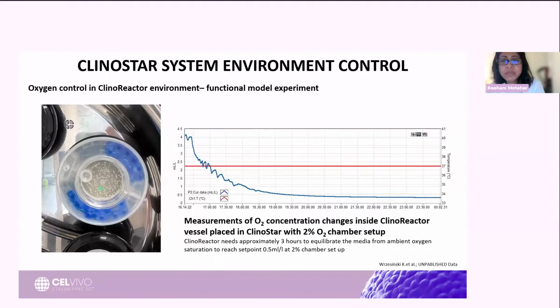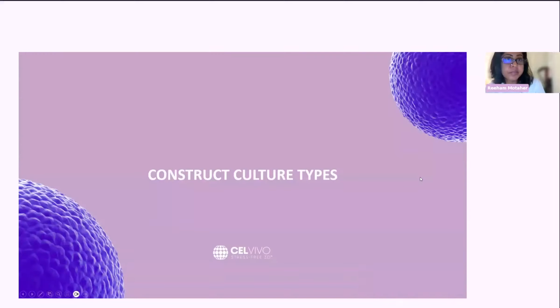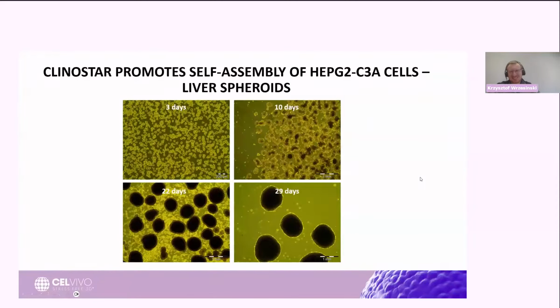Great, thank you. The second question that has come in is, does it create a microgravity environment? So that is a question which I very much like, and unfortunately, no. And we have to say what microgravity is. It's an effect which you can achieve on the space station, or you can achieve it on, let's say, a parabolic flight a bit.